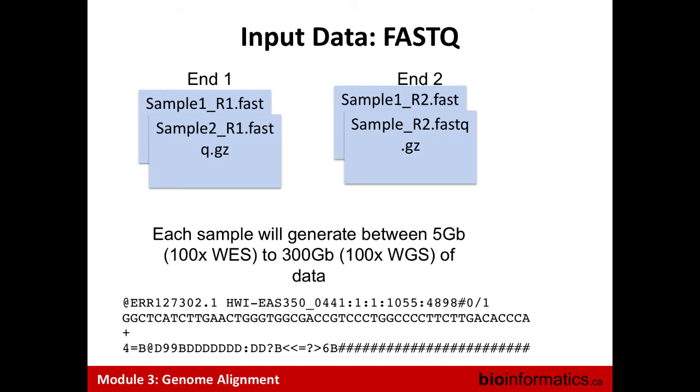So the concept that people have used for that is to use ASCII characters, because ASCII is a computing format you can convert into numbers. So each character, each symbol, using an ASCII table, can be converted to a number. So you are able to say, okay, my first character here, 4, the value of the quality is not 4.